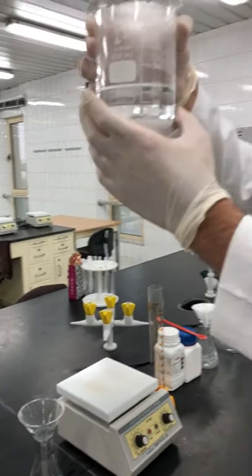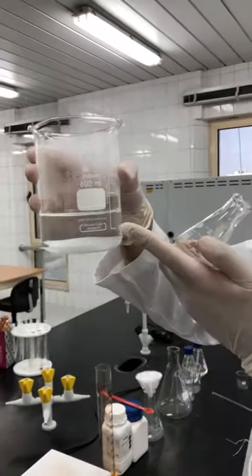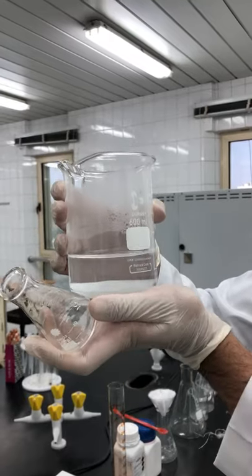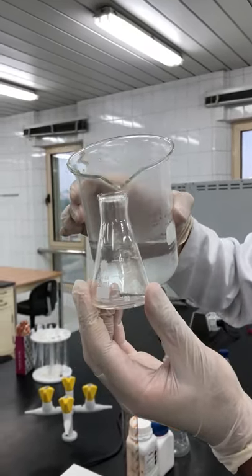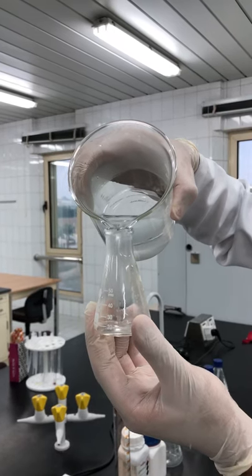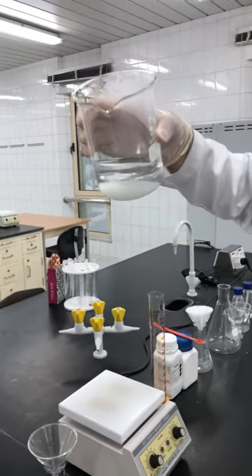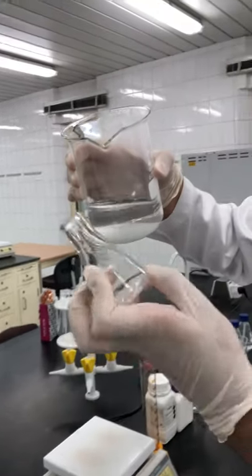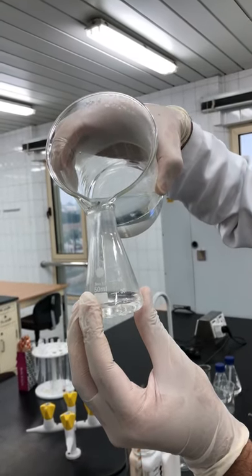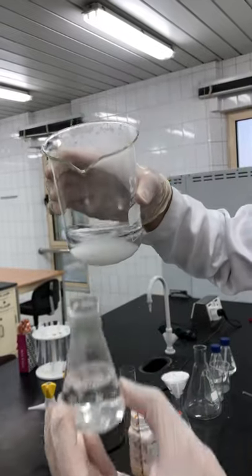I will carefully decant two portions of the aqueous layer to test the excess reactant and the limiting reactant. This is the decanting process — about 40 to 50 milliliters, it doesn't matter. I'll take a second sample to confirm the initial result.